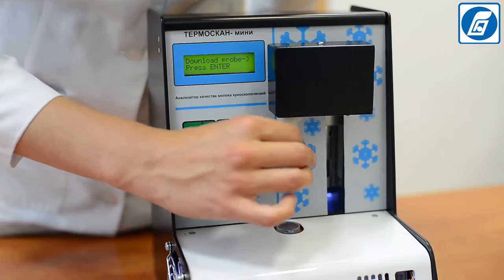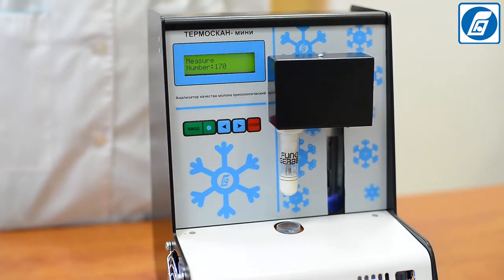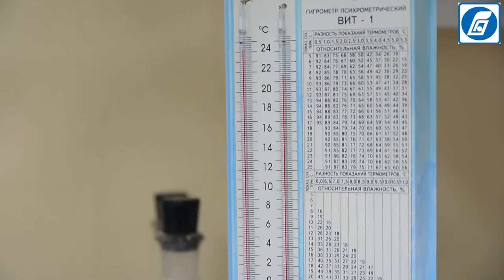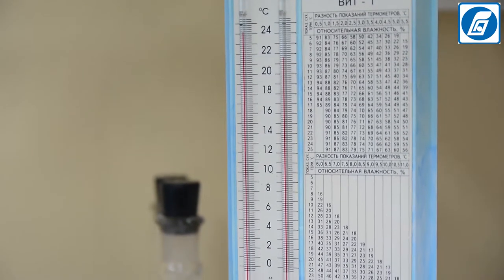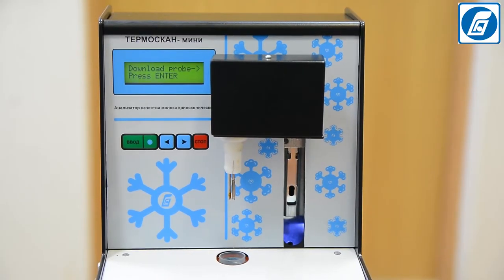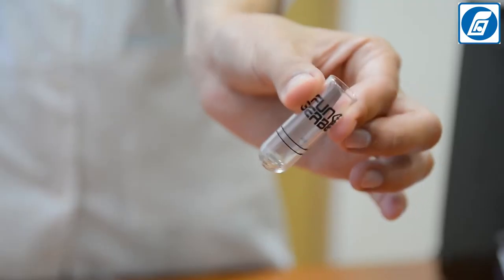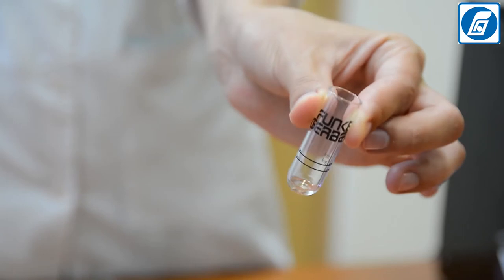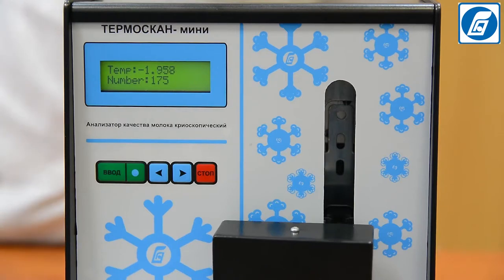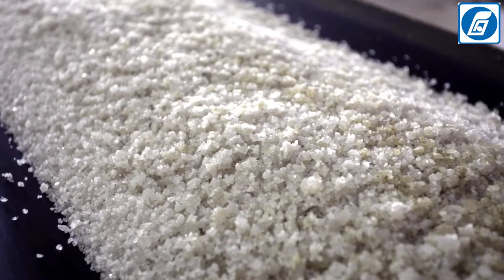If the difference in parallel measurements of the standard solution or milk sample is beyond 0.004, observe the following conditions: room temperature should correspond to normal operation conditions (20 degrees); before each measurement, make sure the probe and stirring wire are clean and dry; test tubes must be clean, dry, and have no cracks or scratches on inner or outer sides. If crystallization does not take place, the most probable reason is added salts in the milk — potassium chloride, sodium chloride, or others.